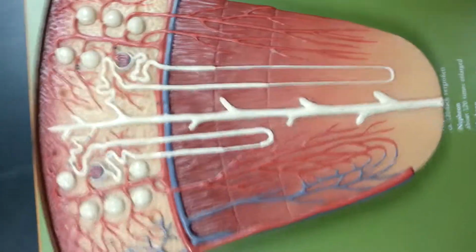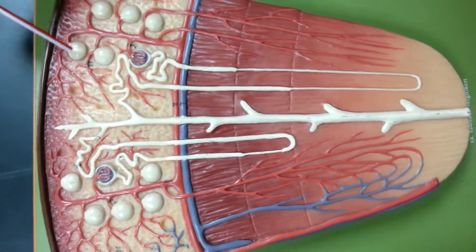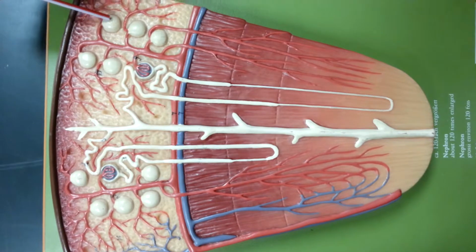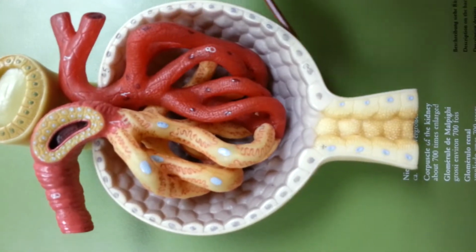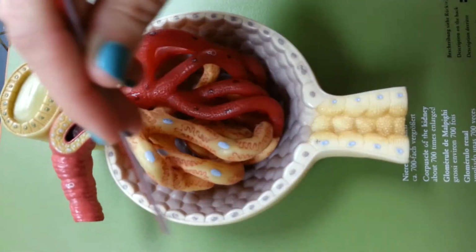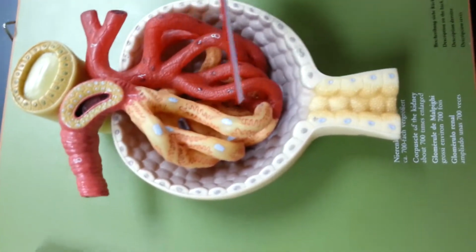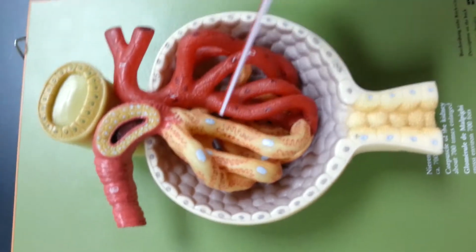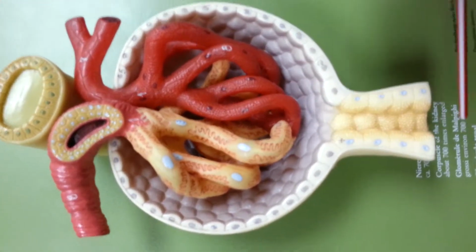Okay, for renal histology, we start with the renal corpuscle, which are these little white bulbs that look like Christmas ornaments that you see here. And then here is a cross-section of that. So this is the outside, and it's the glomerular capsule, the white outer edge. Within that, there's the glomerulus, which is a ball of capillaries where fluid from the blood leaves the capillaries and then goes into the kidneys where it's filtered.